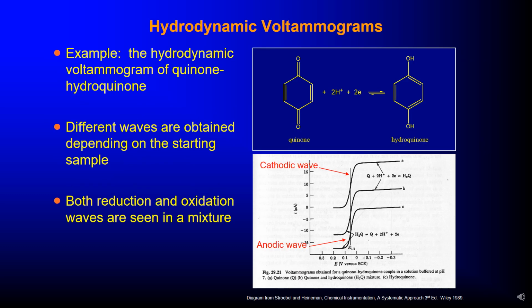If you look at hydrodynamic voltammograms, different waves are obtained depending on the starting sample. Both reduction and oxidation waves are seen in a mixture, as you can see.